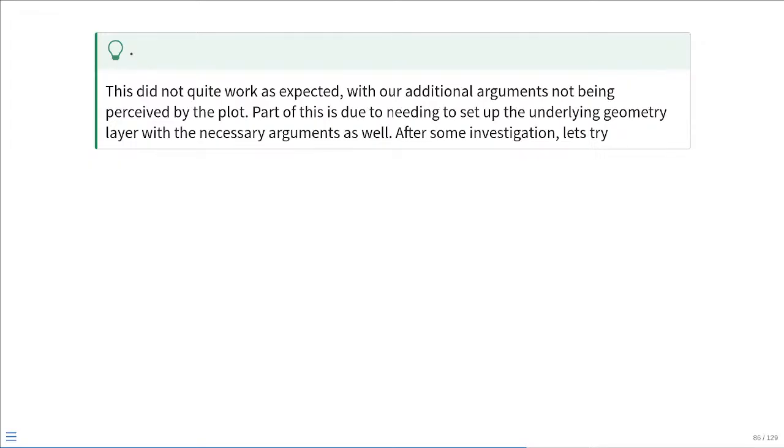You still need to interconnect them with some of those important layers like aesthetics or geometries, just so it knows how to apply these particular conversions you're trying to change.